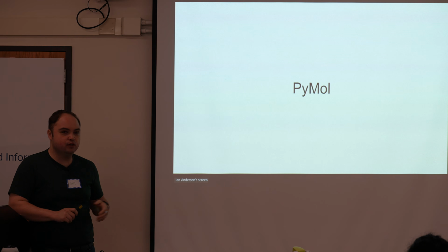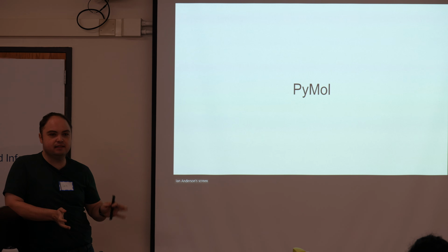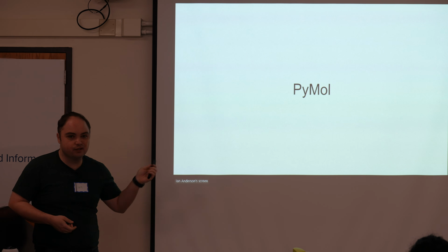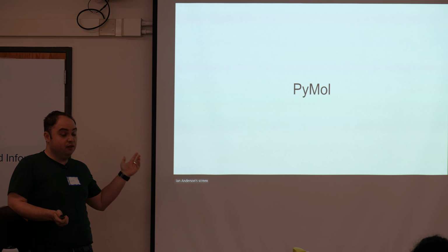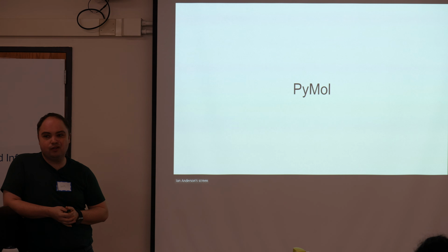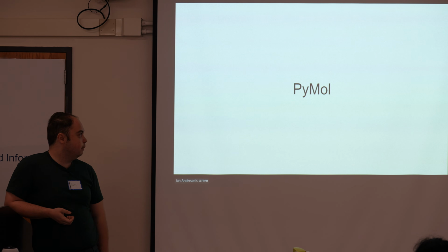I think it's always a good idea to use what your lab and your support system around you use, because I think both tools have very different commands, and it's much easier to get help on the tool that other people are aware of. So for this class, we're going to do PyMOL. If you are very familiar with Chimera and you prefer to use Chimera, if you like doing it in the browser with Molstar, you're welcome to do that as well. If you want to do it in VS Code, you're welcome to do that as well. We're pretty agnostic to the tools that you use. We're going to be teaching PyMOL, so if you don't have a preferred tool, we recommend PyMOL for this. But yeah, so we're going to get started.